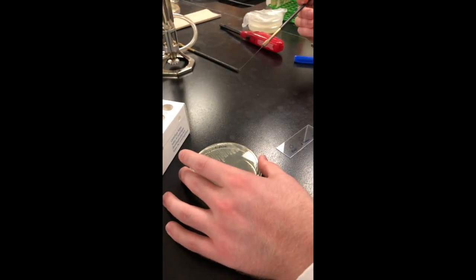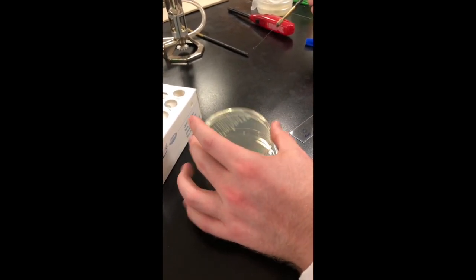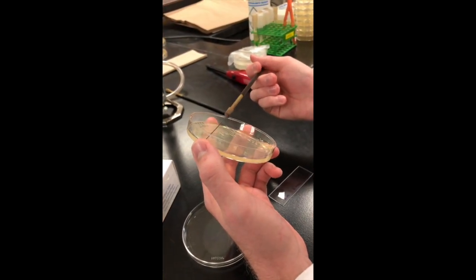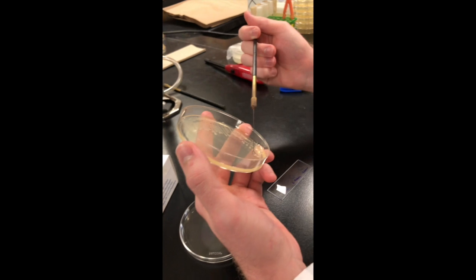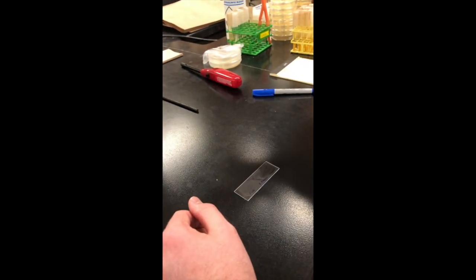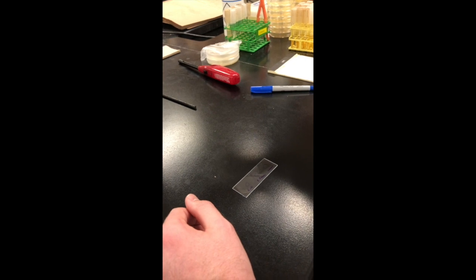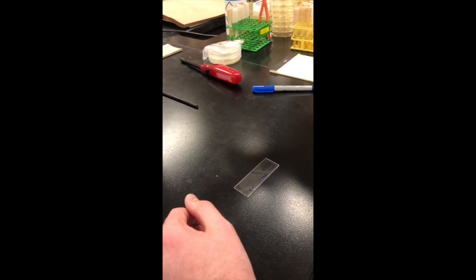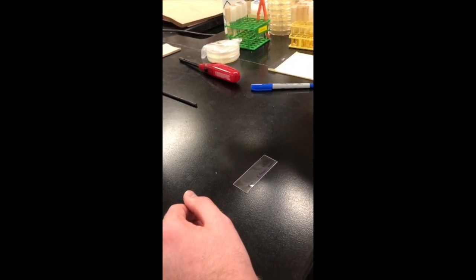And then we're going to get our next bacteria, which is actually from a plate. So we can actually open the plate, pull our loop where there's not any bacteria, and then pick up bacteria from a single colony on the plate, touch that to our second circle, and then flame. So our first circle has E. coli in it, our second circle has Enterococcus, and then our third circle is going to have the unknown.